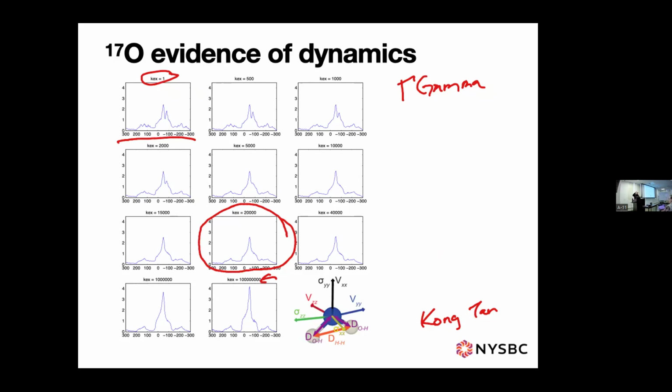So I did simulations where I looked at taking out one of the effects and seeing what happens. If you take out the proton-proton coupling, you don't get the splitting at all. You just get stronger side bands, a little bit. It's broader, it's uglier, mostly spinning out. So it's really this hop coming down and bringing back in the proton-proton coupling.